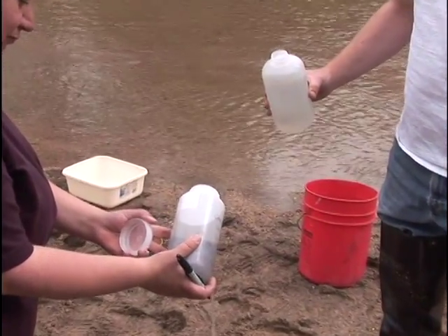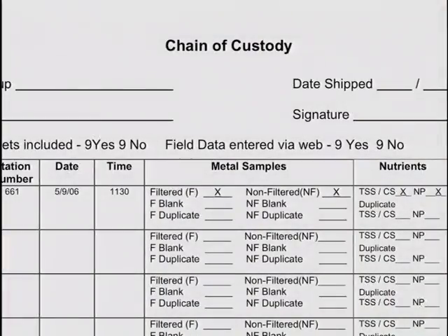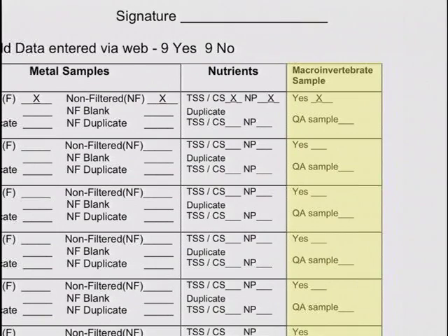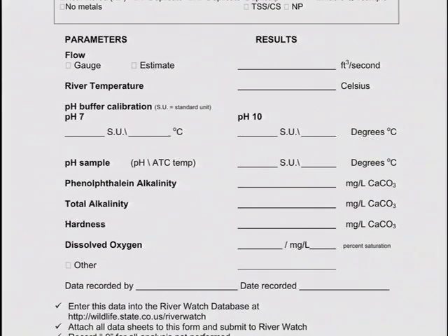Ship or deliver the sample within 2 weeks of collection. Include all data sheets and chain of custody. There is a spot on the chain of custody for bugs, which is also downloadable on our website. Complete a field data sheet to go with the macroinvertebrate and physical habitat data sheets. Include all water quality data that was collected and keep a copy of the data sheets for yourself.